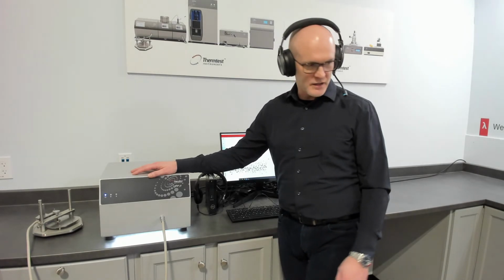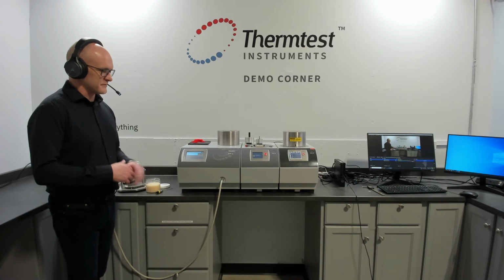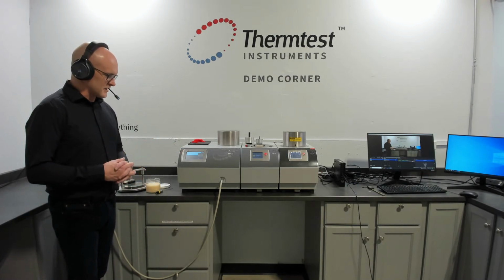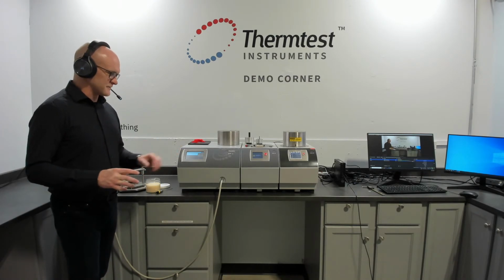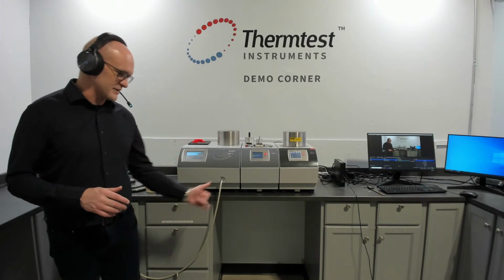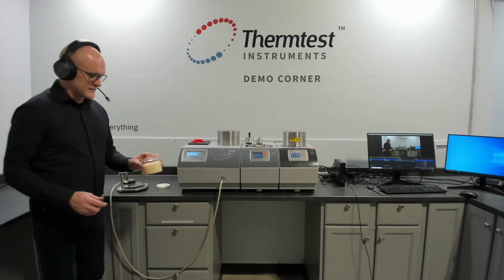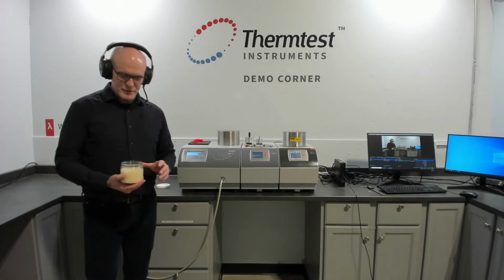But certainly when it comes to the MP-1, it is the application range that makes it popular, but also some of the added features such as wide range of temperature and multi-sample, etc., that really set it apart, in addition to its technical capability. So what we're going to talk about today is polymers through the melt.